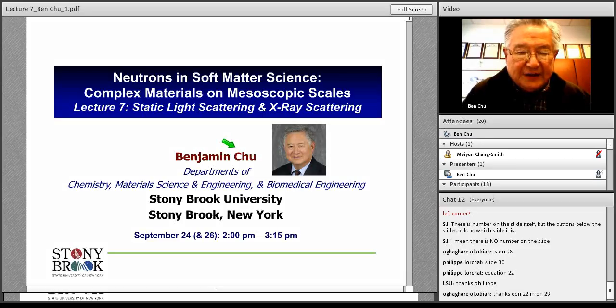To do that, I will repeat myself a little, but let's think about static light scattering for a dilute solution.